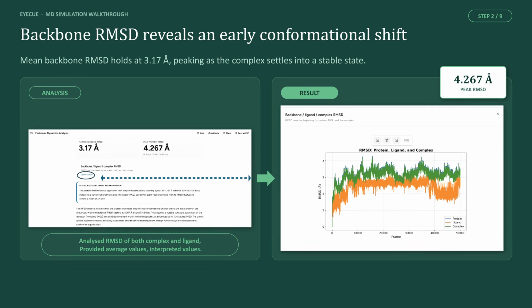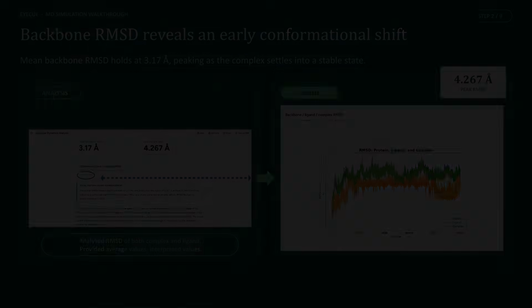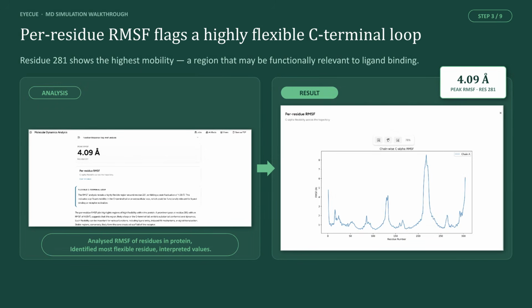The agent will identify frames of higher fluctuations to extract PDB frames for further analysis. Flexible residues and regions of interest were identified through RMSF analysis. Again, the information will play a crucial role in identifying residues and regions of interest for further analysis.